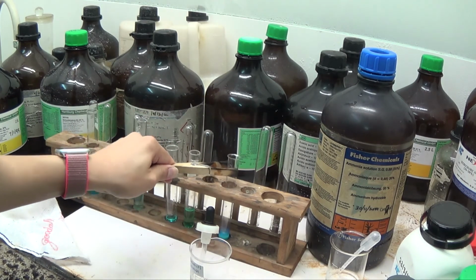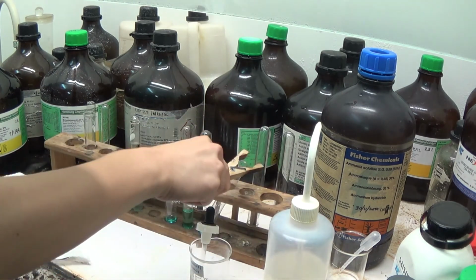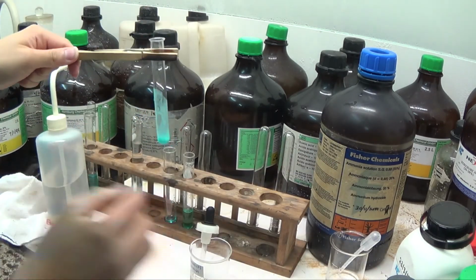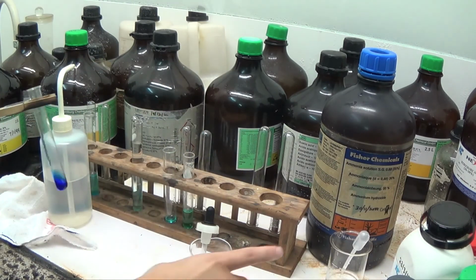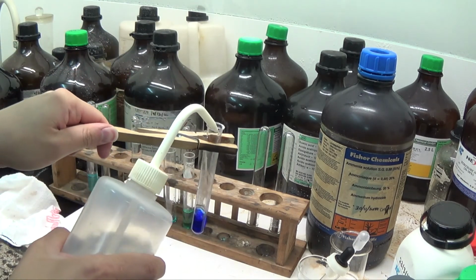Oops, hang on. I need to be picking this up properly. So this was in ammonia a little bit just now. So I'm going to add a bit more ammonia to get the dark blue complex. Okay, so that is nice and happy. Dark blue complex, but then I'm going to add a lot more water.